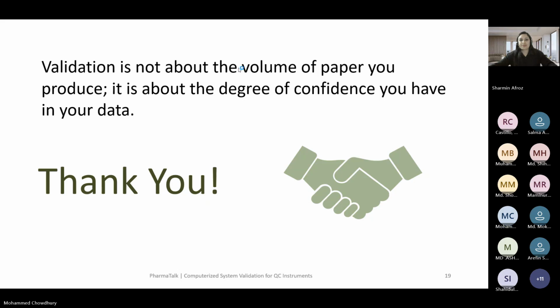Thank you for the nice presentation. I just want to ask a question regarding the IQ, OQ, and PQ. For a few systems in our facility, we perform the PQ by following the supplier protocol, for example, LabSolutions, Shimadzu HPLC, or Waters.